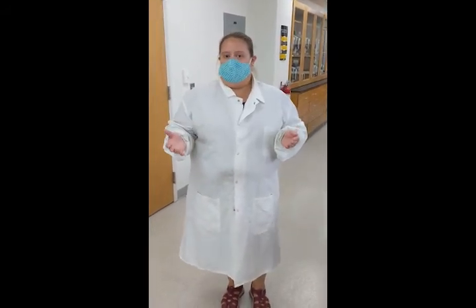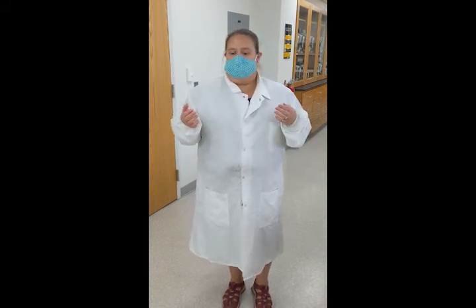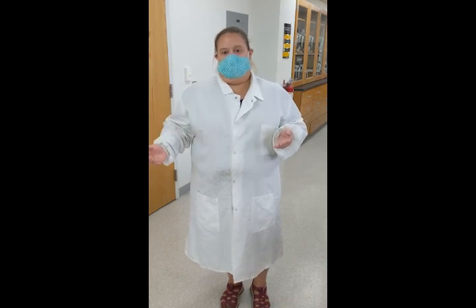Even though you're not going to be in the lab this semester, it is still important that you understand something about lab safety. You may have to use some of these lab safety techniques in the real world once you graduate and find a job. If you work in a lab, you're going to need to do things like wear a lab coat, wear gloves, sanitize your workspace, and handle cultures — so you need to be able to properly use these things.